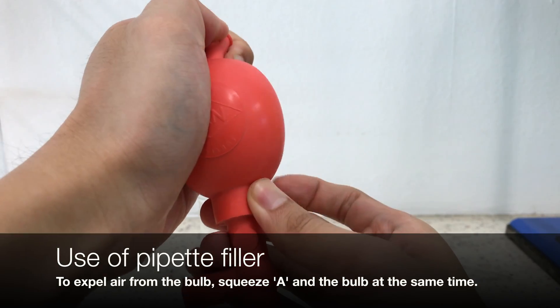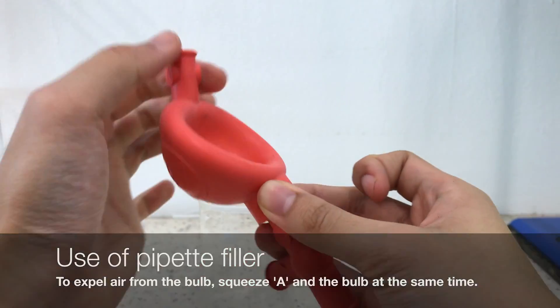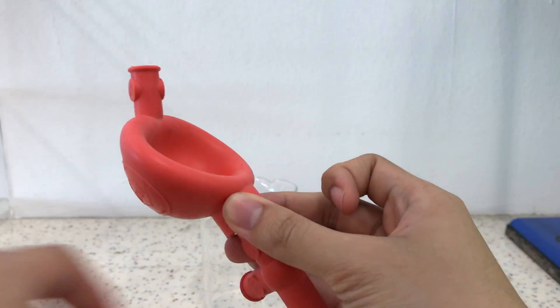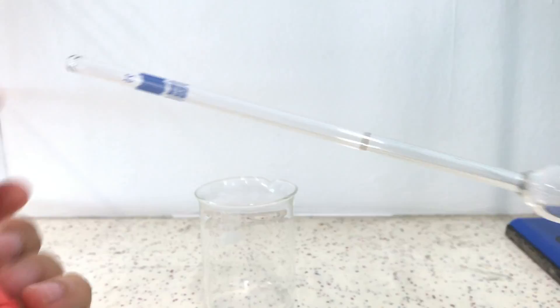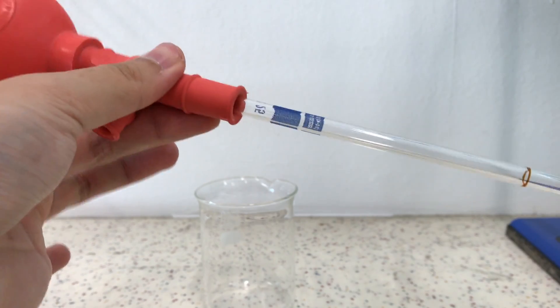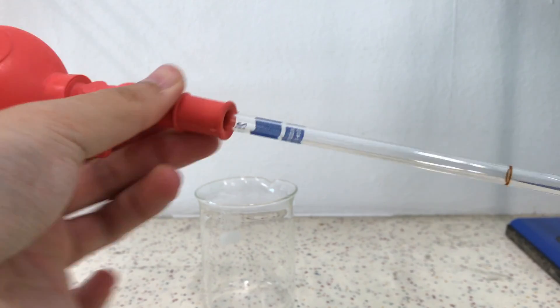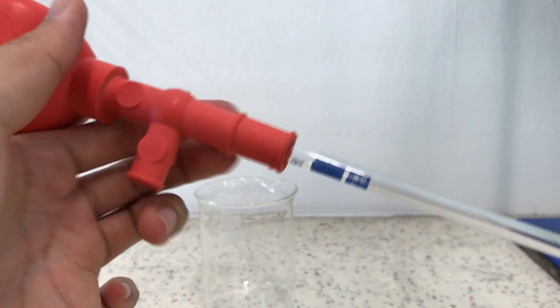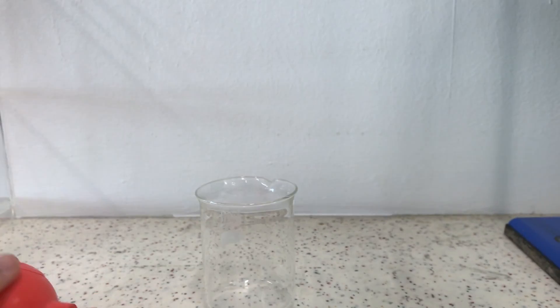Now, we hold down the A to expel the air from the bulk of the pipette, like so. We then twist and insert the pipette filler into the top of the pipette. Make sure it is firmly attached but not too tight.